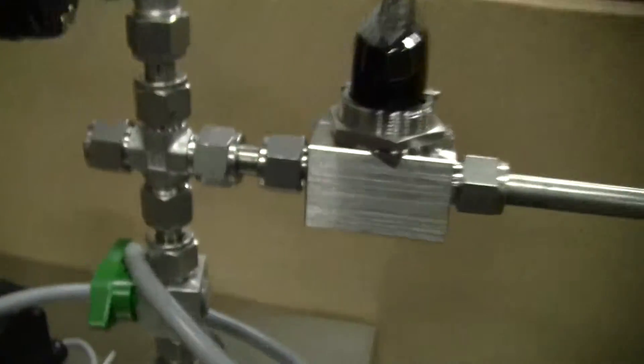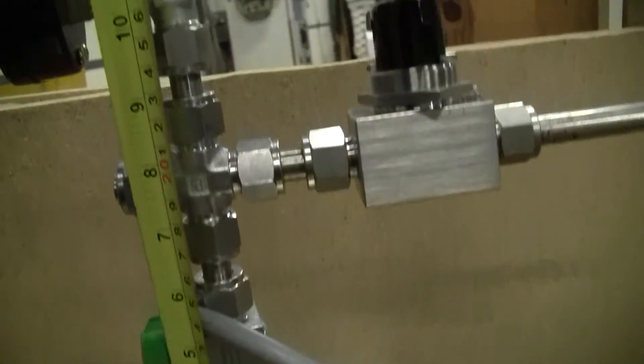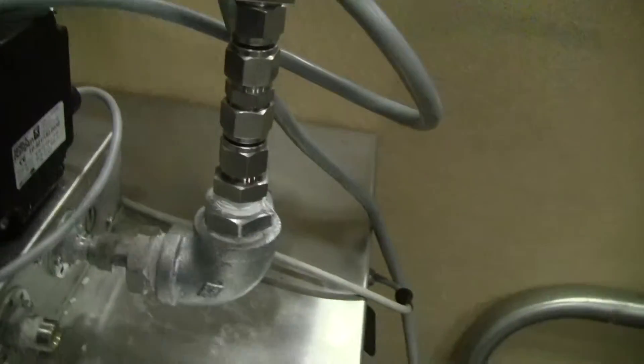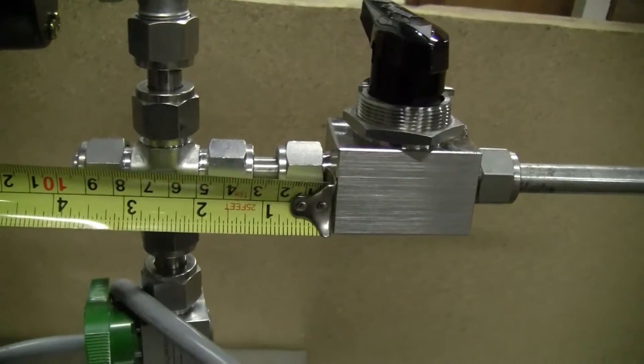Your gauge and your half inch fitting out. The half inch fitting is about 11 inches long up to the gauge, and to the valve about 2 inches.